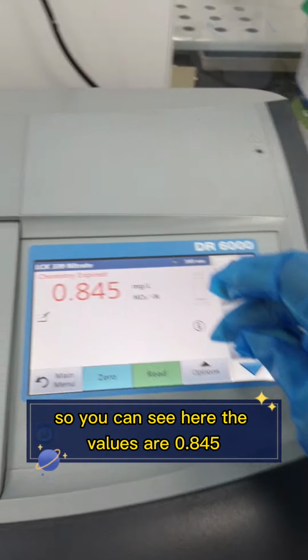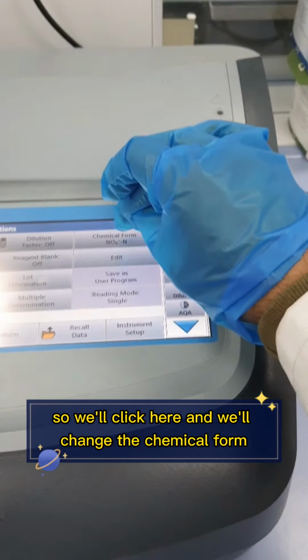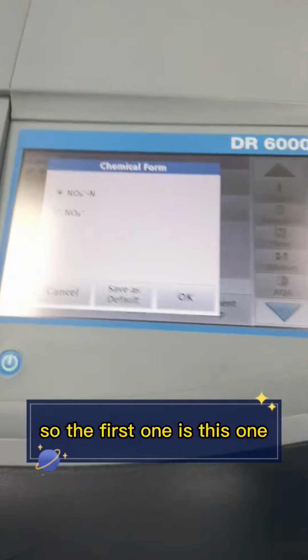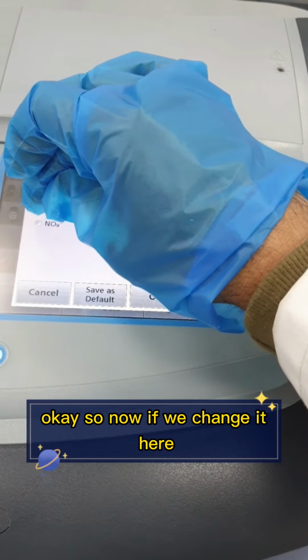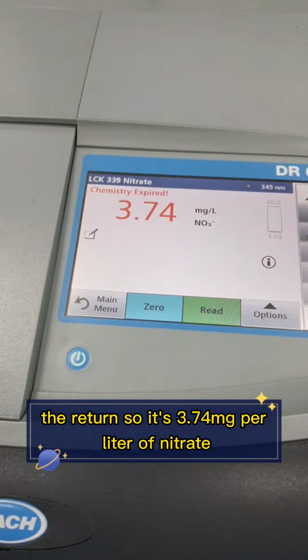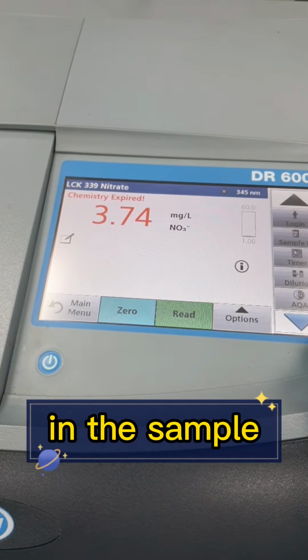So you can see here the values are 0.845. So we'll click here and we will change the chemical form. Normally nitrate occurs in 2 forms. The first one is this one, and the second one is this one. Okay, so now if we change it here, the return, so it's 3.74 milligram per liter of nitrate in the sample.